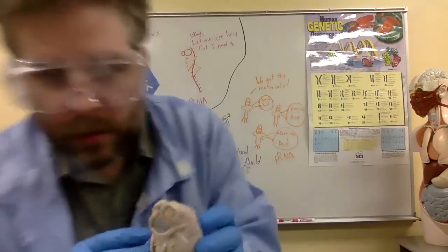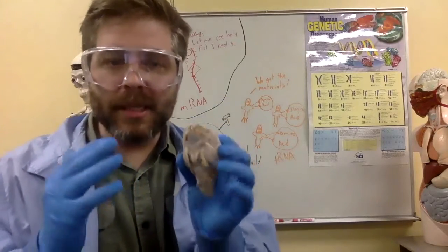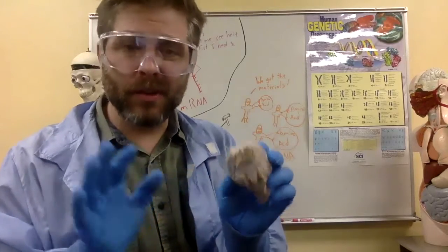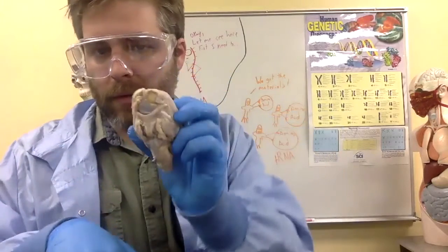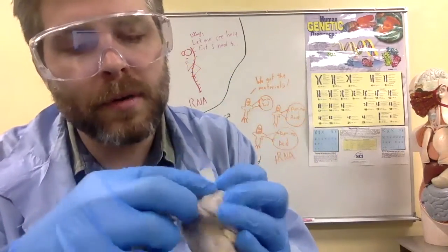So guys, in order for your brain to be aware of what's going on, it needs nerves to go into the brain. Once I cut this covering off, I'm probably going to cut some nerves off too. I want you to see those nerves. Look in close. This is underneath. Right? This is the brain. The sheep is looking in this direction. So underneath, we got some nerves sticking out.